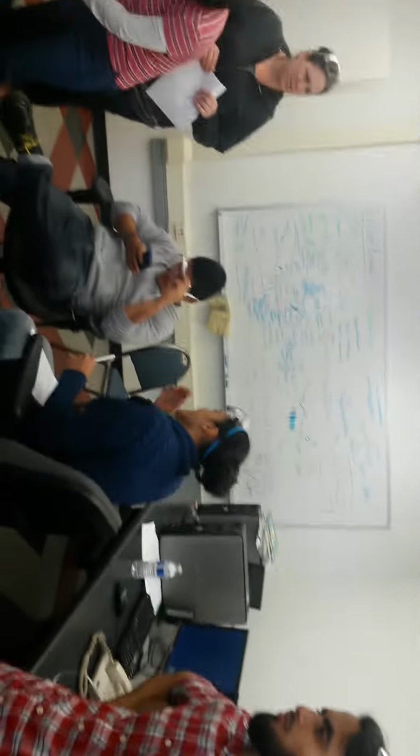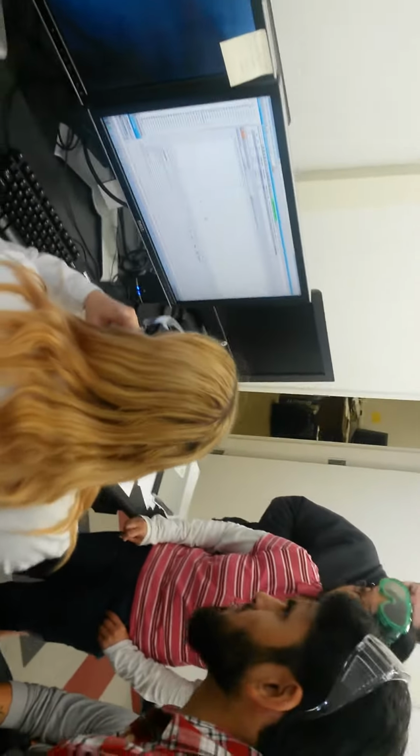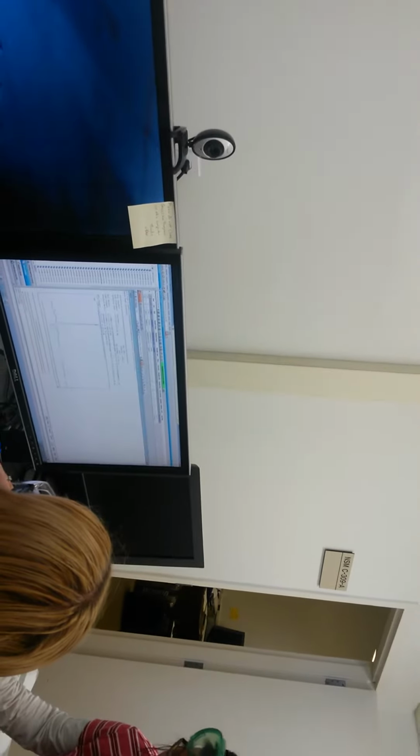But we're not there yet with that. To save the file, let's just say this was your file. The way you would save it is you go here to print, and have it print into Adobe PDF. You can print it to the desktop or wherever, and the computer that you're logging into has internet, so you can then sign in and email it to yourself. That's for HPLC.